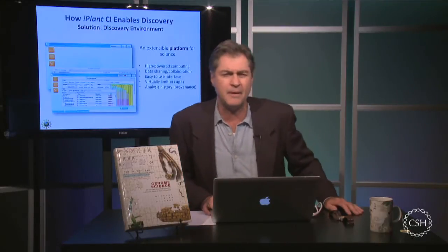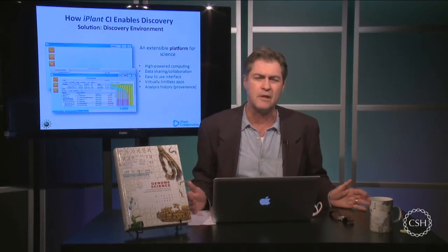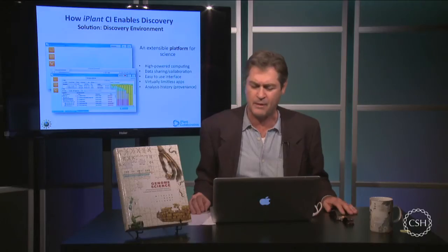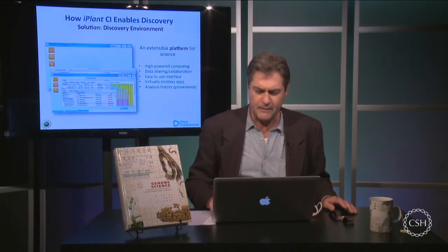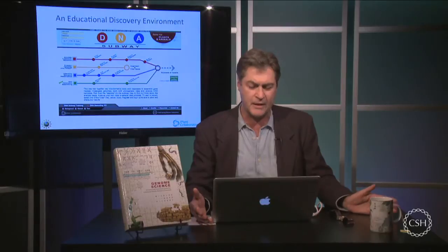Well, the key element of the iPlant cyber infrastructure is what we call the discovery environment. It's essentially an app store for lots and lots of applications that could help you solve many problems in biology. I encourage you to look at it and to explore it for the tools that may help you. But today, we're going to use the sort of educational analog to the discovery environment, which we call DNA Subway.